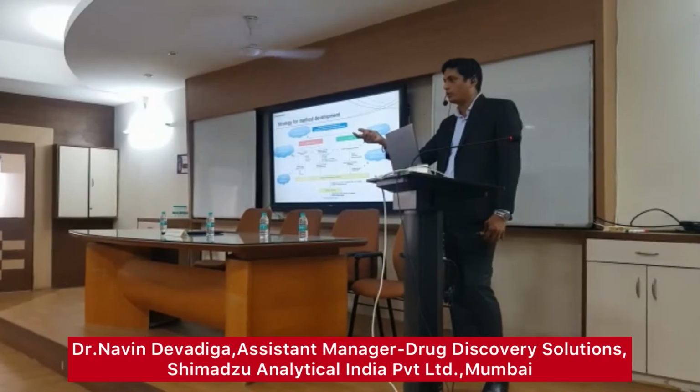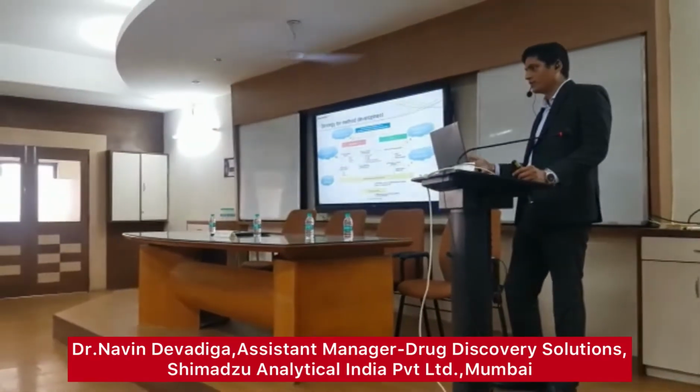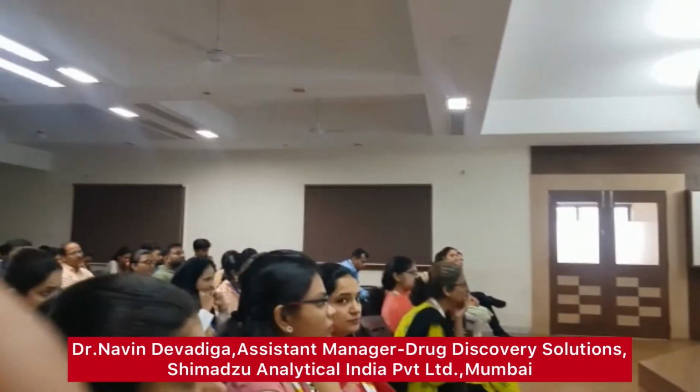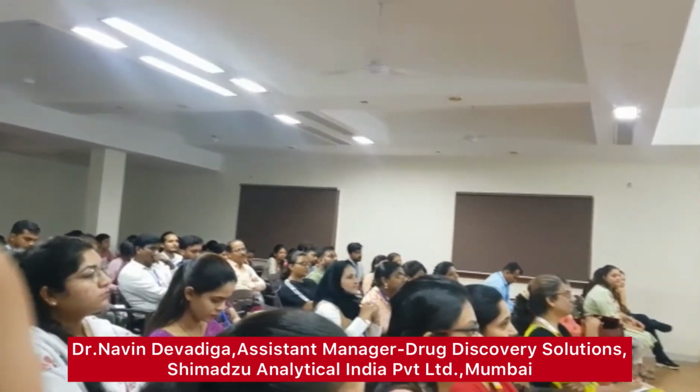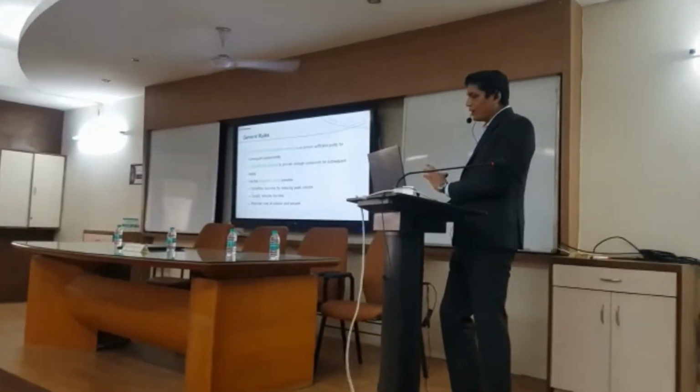Your molecules. So you need to avoid this kind of additives when you are doing the method development on those things. So these are the points which you need to take into consideration along with the method development activities which you are doing for your conventional HPLC analysis. The general rule to be followed is to try to optimize the chromatography.